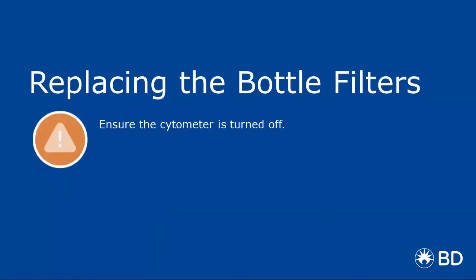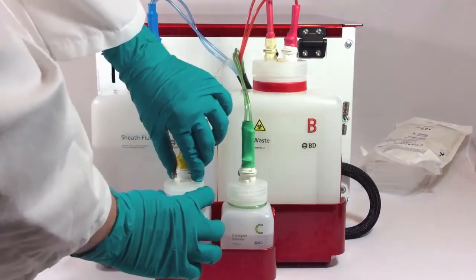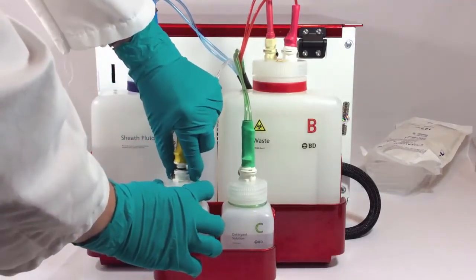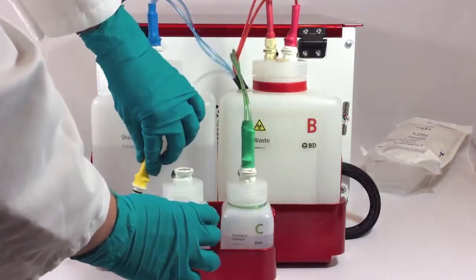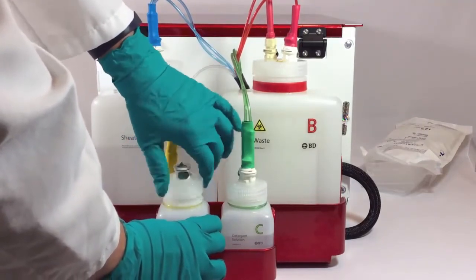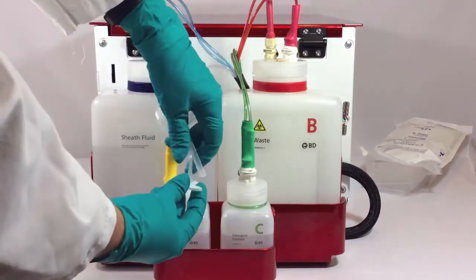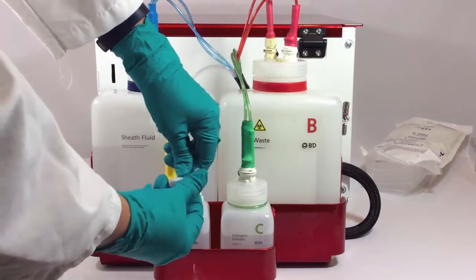Next, we'll cover the procedure for replacing the bottle filters. To get started, disconnect the Quick Connect line from the top of the bottle. Remove the bottle lid, disconnect the filter luer connector at the end of the fluidic tubing, and then discard the filter as you would a biological sample.